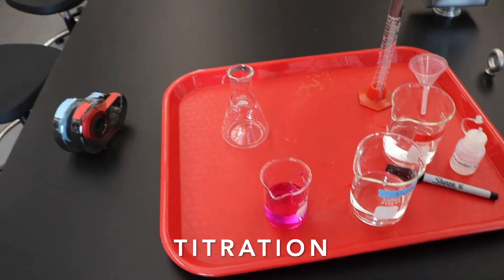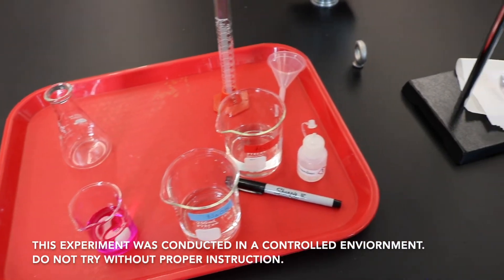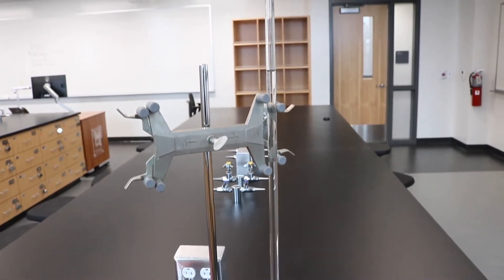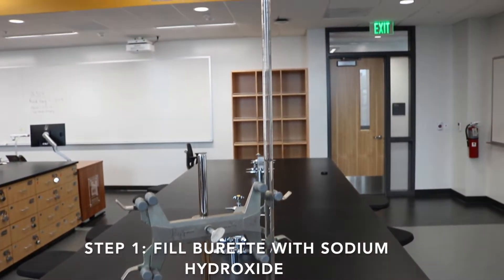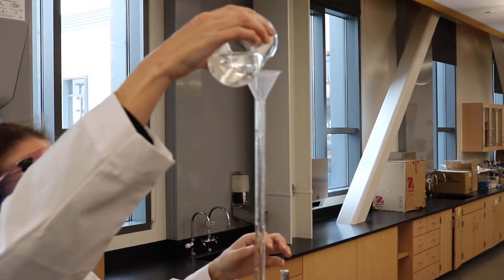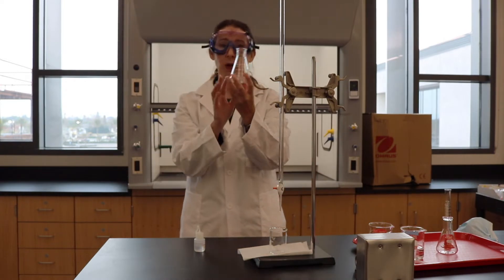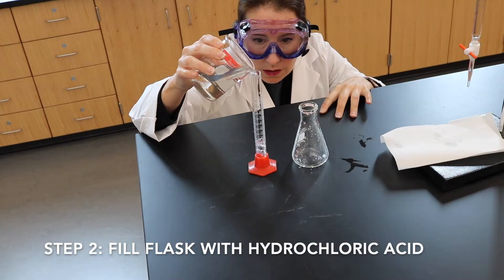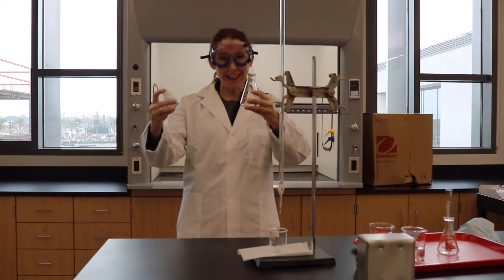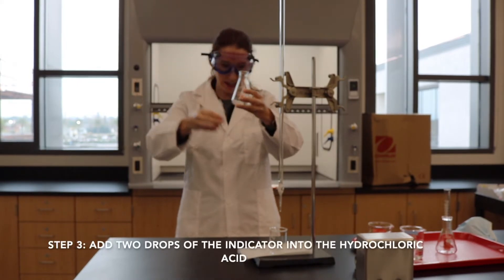This is an experiment that we do in our Chem 219 class of general chemistry. This instrument here is called a burette, and what I've done is I've put sodium hydroxide, which is a base, and filled this burette up to the top. In here I put hydrochloric acid, which is an acid, and what I'm going to add to this acid is an indicator — this indicator is called phenolphthalein — so I'm just going to put two drops of this indicator in.